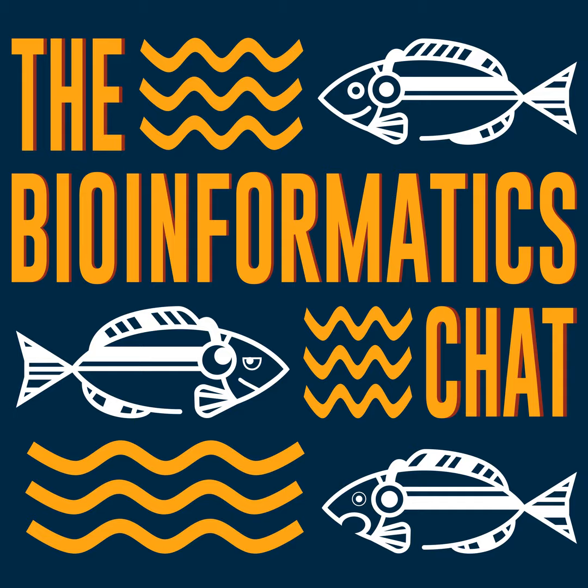So even with a brute force decoding method, it still only takes a minute or two in order to find the closest answer. And we can also stop early because we have those guarantees that you mentioned about being able to decode with a certain distance with a guarantee. In our case, the minimum distance between the tags is 18. And so we're guaranteed that the decoding will be correct if we have fewer than 9 errors. Meaning, even though it's brute force, we probably will be able to stop early on average and not search through the entire set of possible code words.